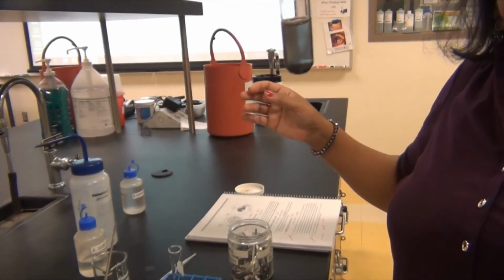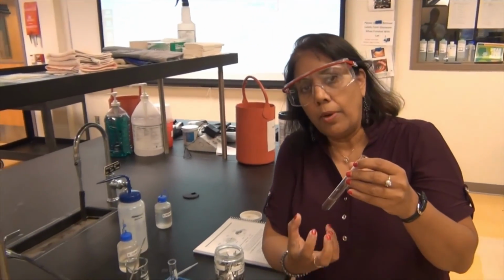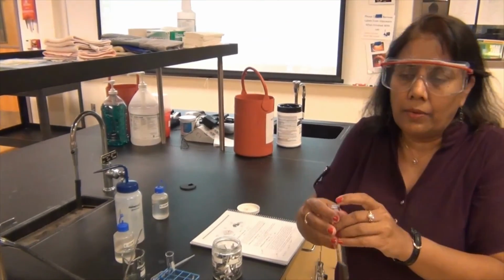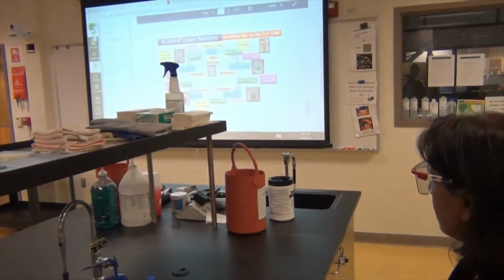And this is it. If we were doing a quantitative thing, we would have centrifuged this so we get the copper at the bottom, and then remove the water, dry the test tube. So it would have taken another half an hour to finish all of this. But this is it. This is as far as the whole cycle of copper reactions that we did.